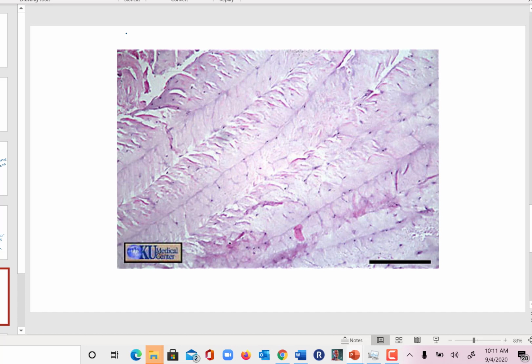The last slide, well, it's not quite our last slide, is fibrocartilage. So it's the last of our 3 cartilage types. Fibrocartilage has numerous coarse, readily visible fibers in its extracellular matrix. It is again, like the other cartilages, more gel-like in the extracellular matrix. The fibers are arranged as irregular bundles between large chondrocytes. The chondrocytes don't look large in this picture because we're not at a high magnification, but we can see the chondrocytes here living in their lacunae.